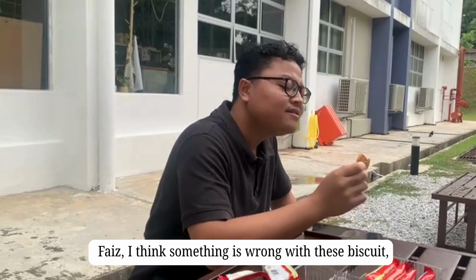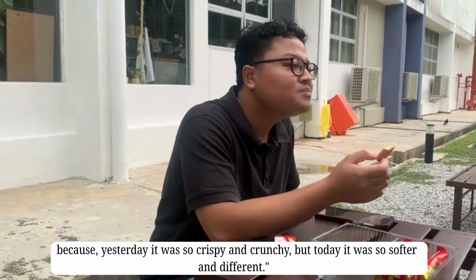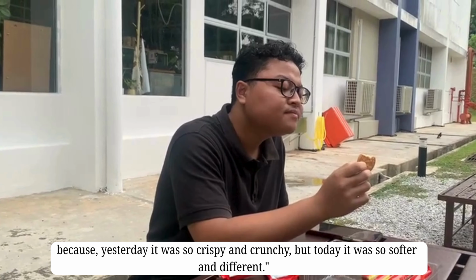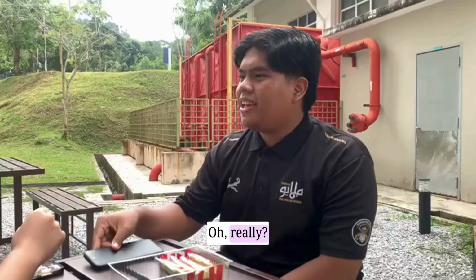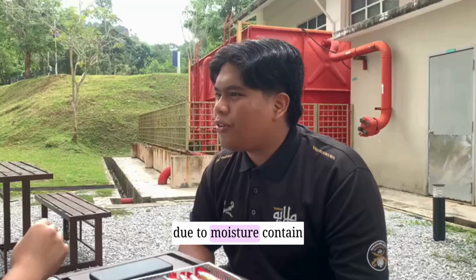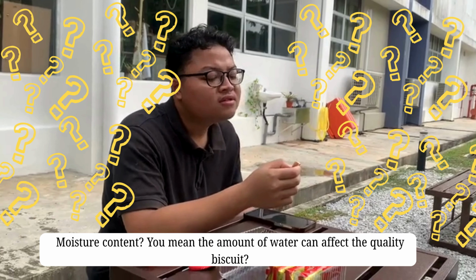Faiz, I think something is wrong with this biscuit because yesterday it was so crispy and crunchy, but today it is so much softer and different. Oh, really? This problem might be related to the moisture content. Moisture content? You mean the amount of water can affect the quality of the biscuit?